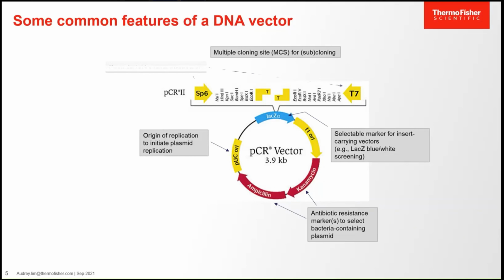Finally, the multiple cloning site usually will be flanked by promoters if it is for gene expression. So if it is a gene expression vector, then it will have this.